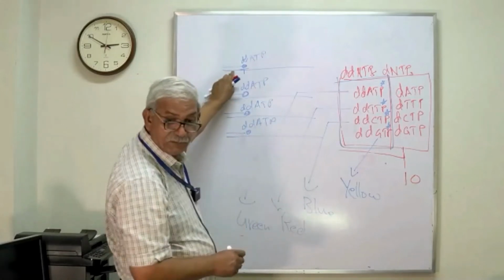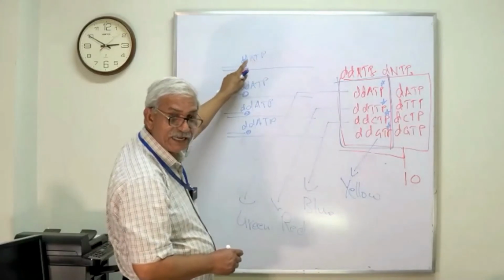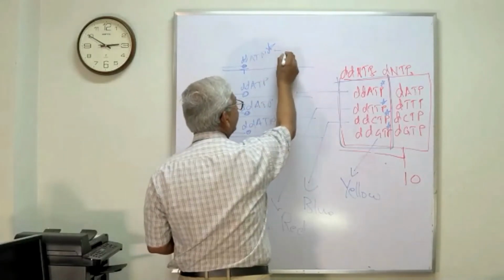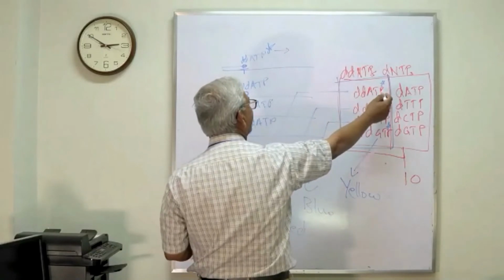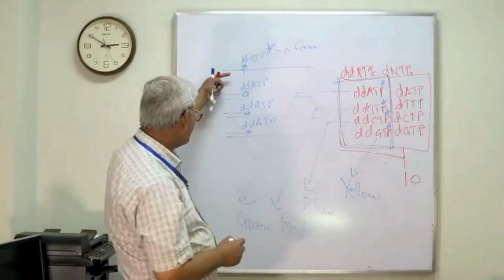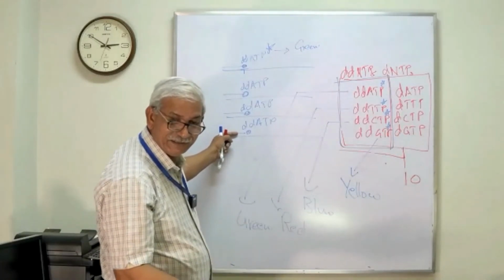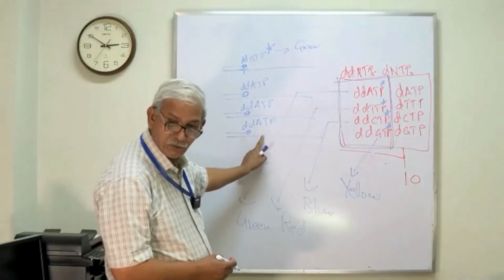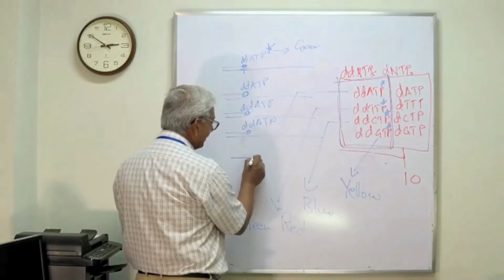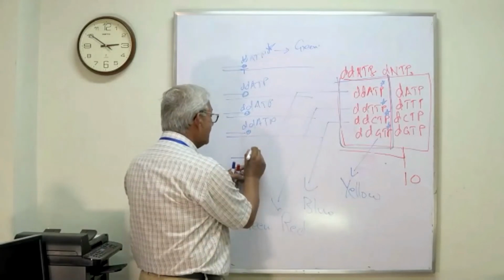One, two, three, four fragments have terminated with dideoxy ATP, and dideoxy ATP is a labeled compound which has a color, and that color is green. So each of the fragments which is terminated, in millions of the fragments, will end up with dideoxy ATP. Okay, the length of the fragment is primer plus one nucleotide. So what I will write here is green.